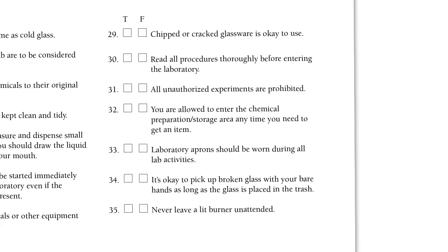Chipped or cracked glassware is okay to use. Yes. False. Read all procedures thoroughly. Yep. All unauthorized experiments are prohibited. True. That's worded tricky, but it's true. You are allowed to enter the chemical prep storage area anytime you want. Yes. Lab aprons should be worn at all times. I think the answer is true. I do have aprons if you're concerned about getting your clothes dirty or smelly. It's okay to pick up broken glass with your bare hands as long as you place it in the trash. No. And never leave a lit burner unattended. True. Yeah, it should have.